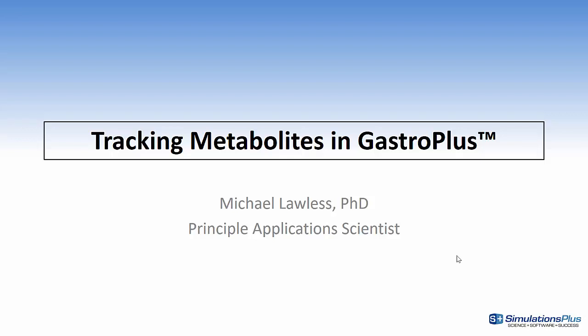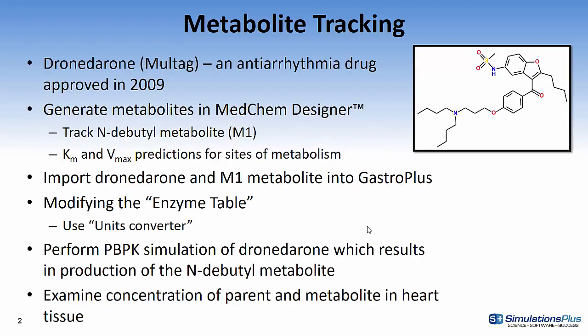Hi, this is Mike Lawless and in this video I'll discuss how to track metabolites in GastroPlus. I'll be using Dronedarone as an example.